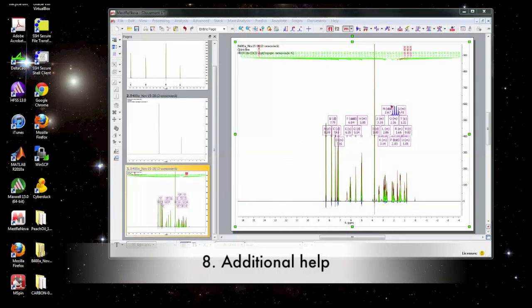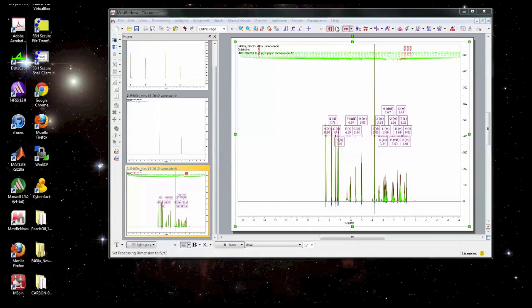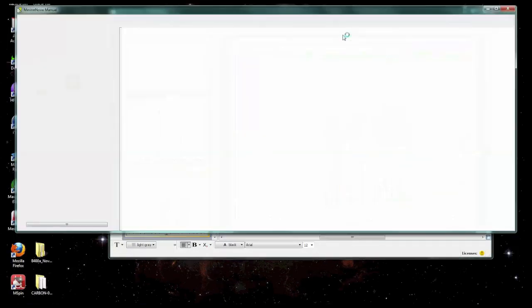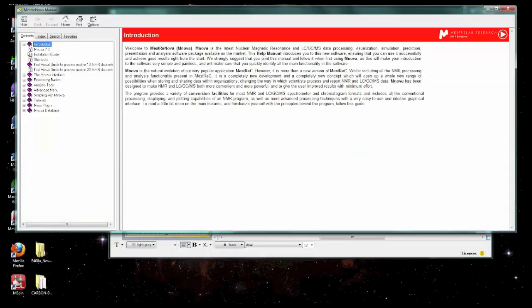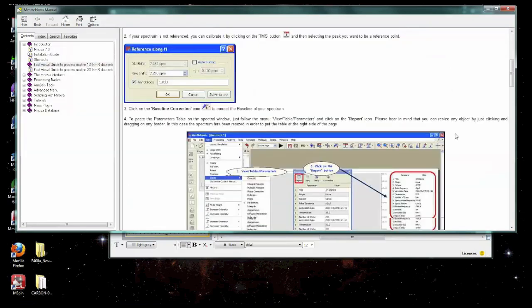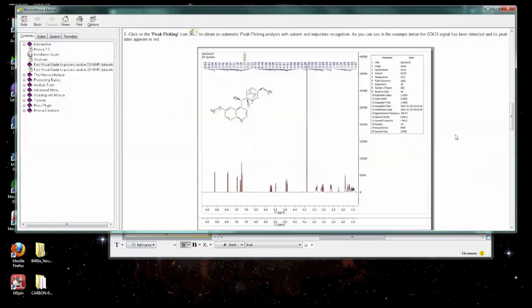Okay, this concludes the basics of processing 1D NMR data. For more information, you can go into the help, contents, and you can look at the fast visual guide to process routine 1D NMR datasets. It covers many of these same points.